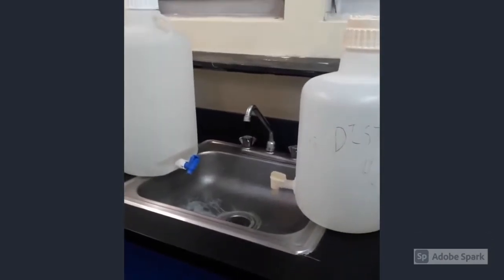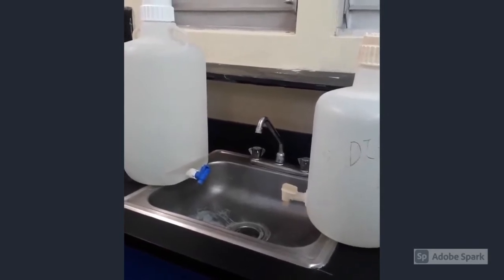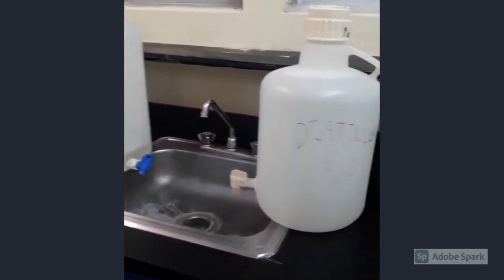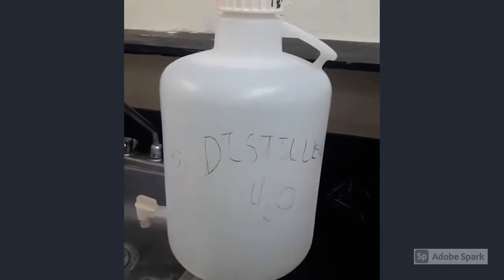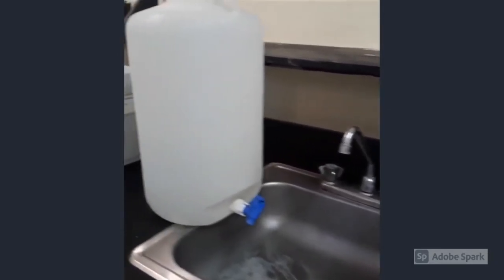The products that are made inside of this particular laboratory requires you to have distilled water, which means that you cannot use the water from the taps, so no tap water, but distilled water, which is placed in these two jars or containers at the back of the lab, and you'll fill your individual container from them each day that you're having your dispensing labs.